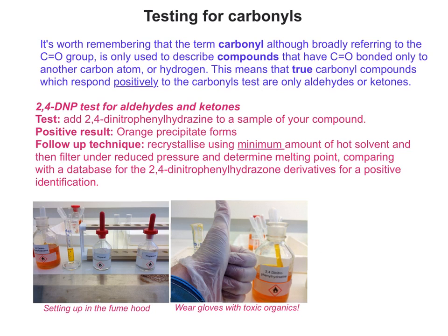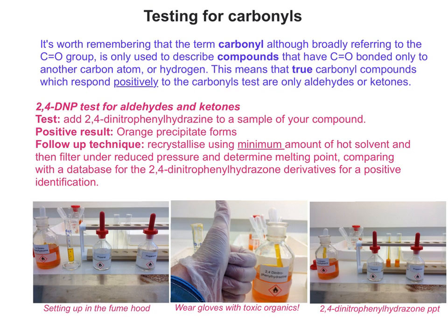So the next thing to do is to show the precipitate you're looking for. In the final picture you've got the 2,4-dinitrophenylhydrazone precipitates. Now obviously the purification process for these is slightly outside the scope of this particular clip. I have another clip on organic solid purification. I think it's called organic synthesis techniques or something like that. But it's worth remembering that these are now crude products and therefore need further purification. The details of this further purification would be in the follow-up technique part of the screen.